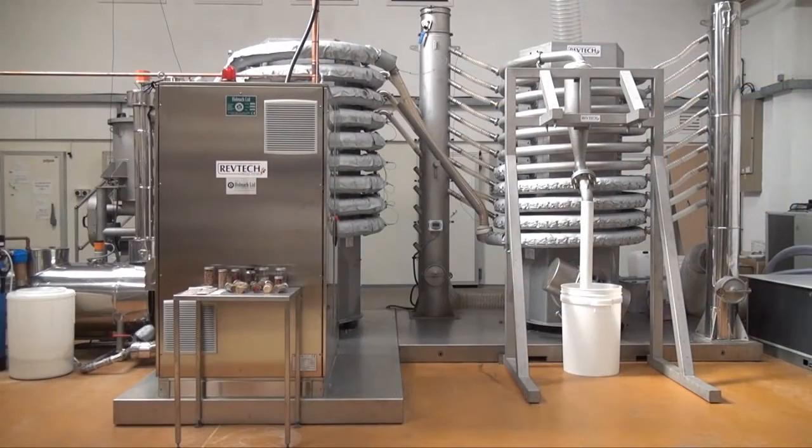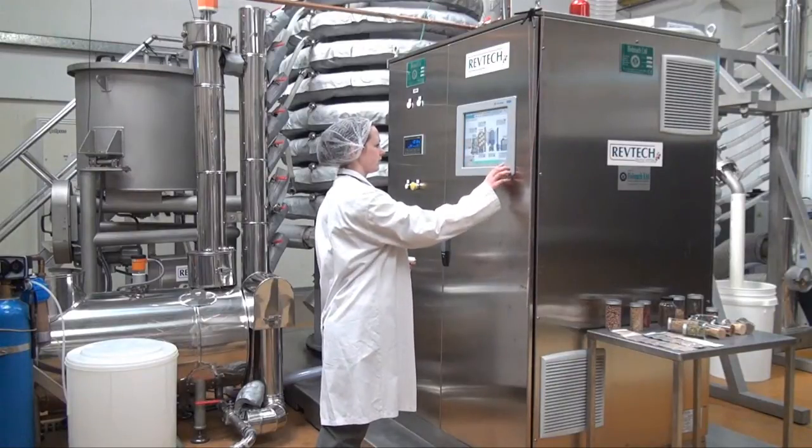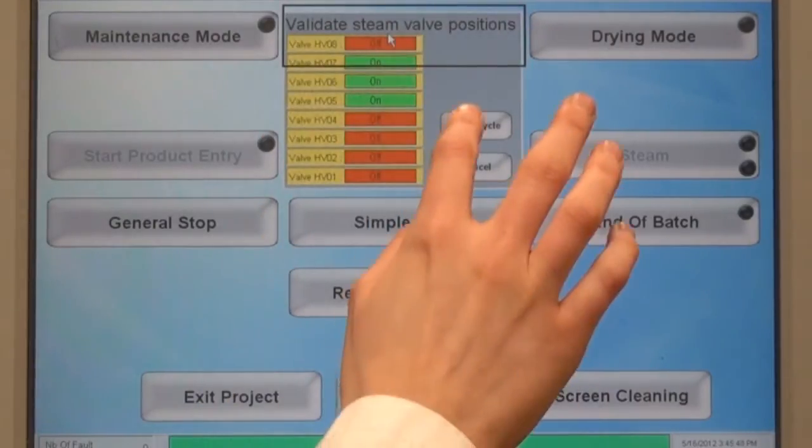The system shown here is for decontamination of low-moisture foods, such as seeds, nuts and spices. It incorporates electrical heating with superheated steam, followed by a drying step to remove moisture before packing.